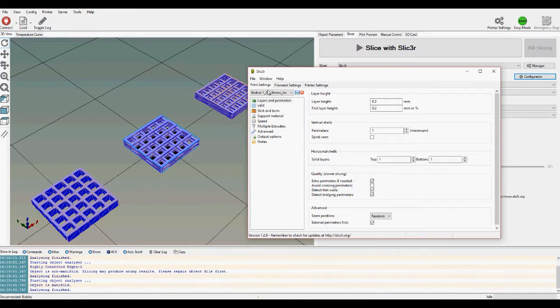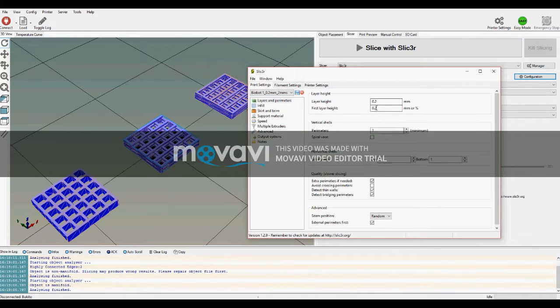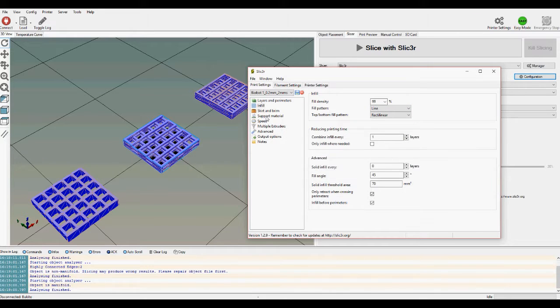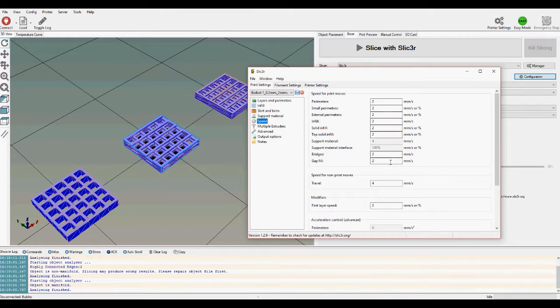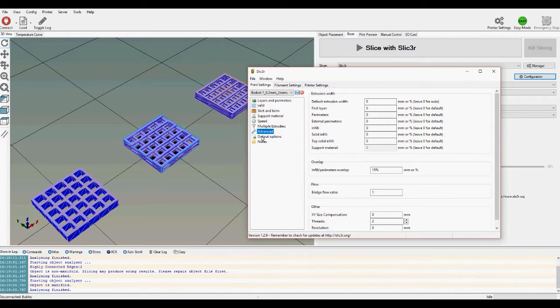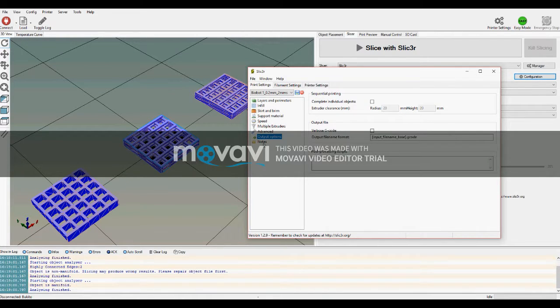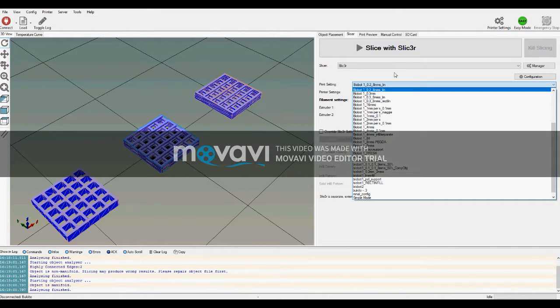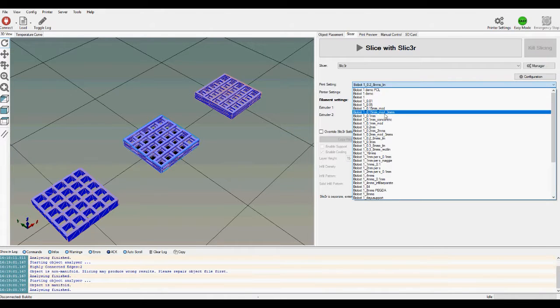We will set a path height of 0.2 millimeters, the same width as our lines and layers, with fill patterns of rectilinear and line, with a 99% infill. We want to make sure all of our speeds are consistent, which we will set to 2 millimeters per second for this example. Then, under printer settings, we want to make sure our extruders are also set at 0.2 millimeters. Save these settings, then select them to slice our files.